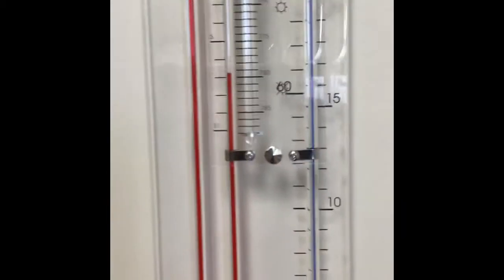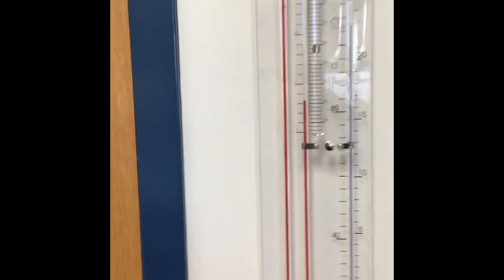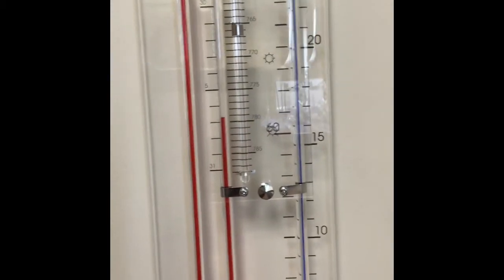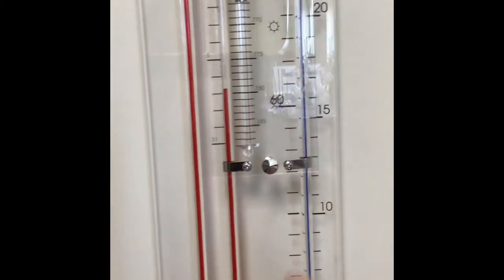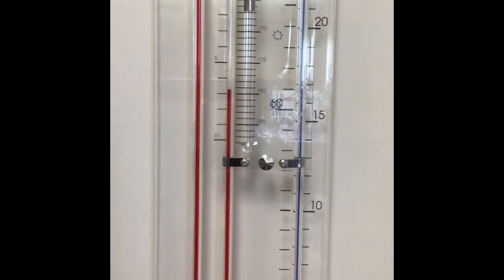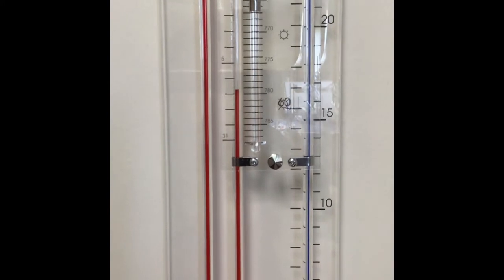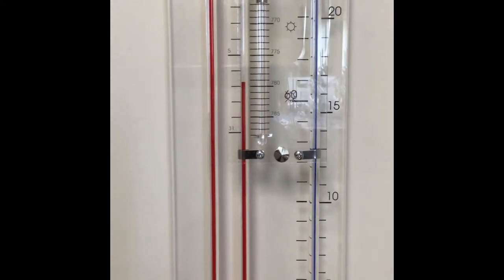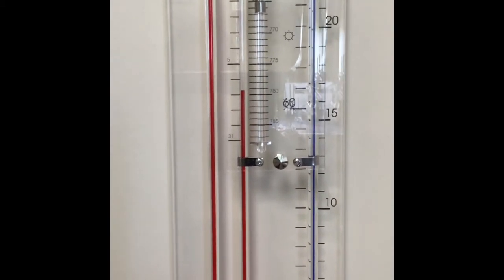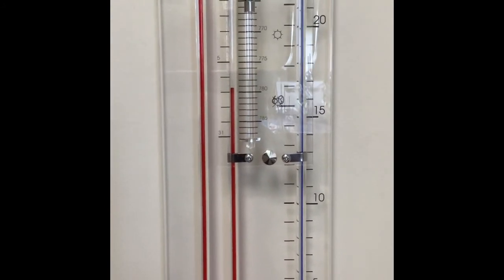And then once that's even, there's your U-shaped tube of the barometer. You need to read that, and the scale that we want is the millimeters of mercury scale, so that's the one on the right hand side here. Notice that it's an inverted scale, so that is just below the fourth line under 775, so that's actually 779, and then you estimate one additional place, so it looks like 779.2 in this particular reading. And so that would be 779.2 millimeters of mercury.